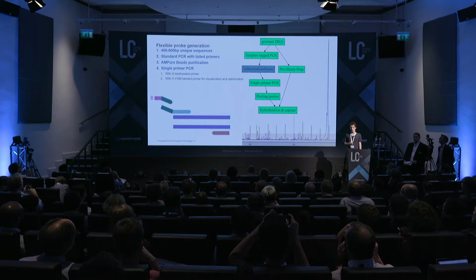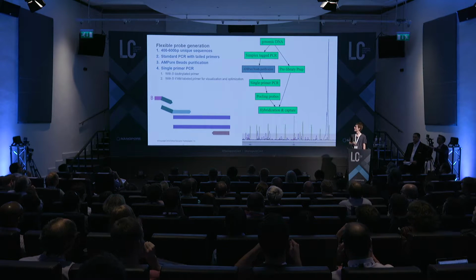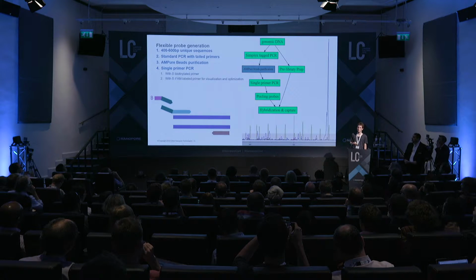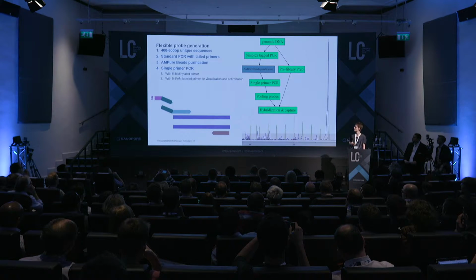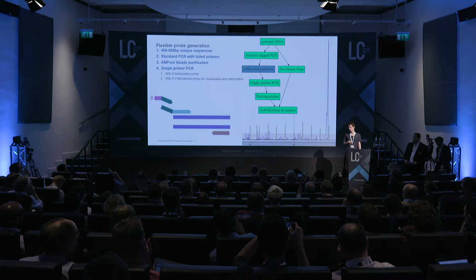In the first PCR, just a standard PCR, a fragment in the locus of interest is amplified, and this is done with a tailed primer. So after purification, a second PCR with just one 5' biotinylated primer is used as an asymmetric PCR, yielding single-stranded probes. I have the same primer with a FAM label, so I can just optimize it using capillary electrophoresis.